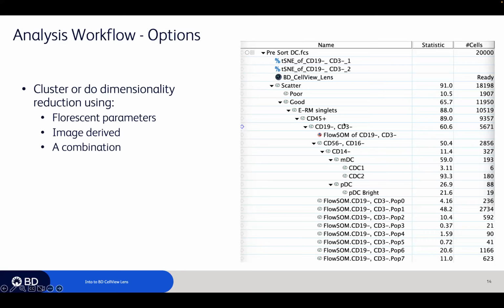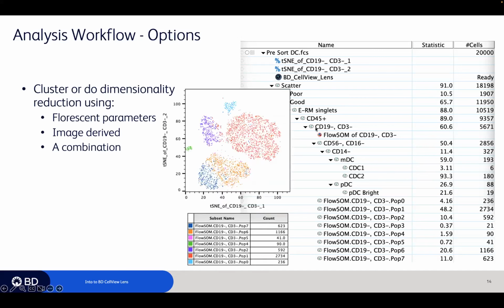So t-SNE up there. And so, we get what ends up looking like a clustering result that lines up very nicely with the t-SNE result. It's always nice when you feed all of the parameters into two different approaches and they give you results that look like they match up. t-SNE put together groups of cells that it thinks are similar, and clustering without knowledge of what t-SNE is doing, clustered them and put the similar cells together as well.